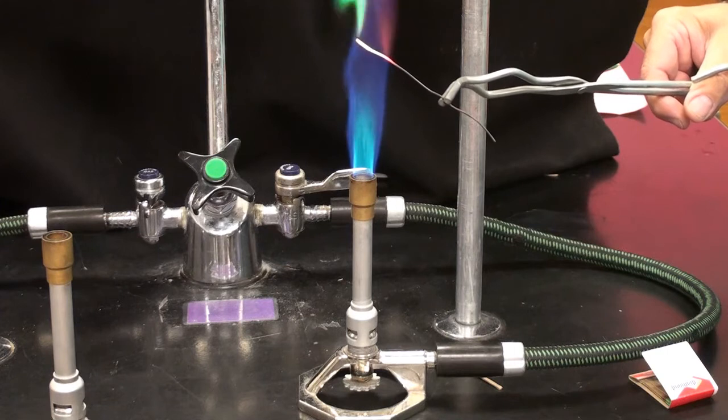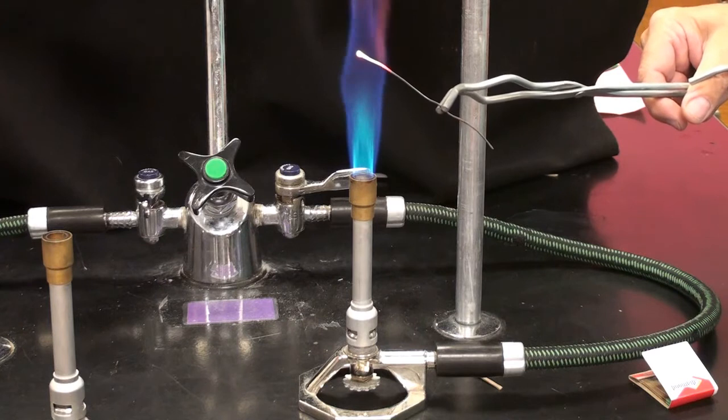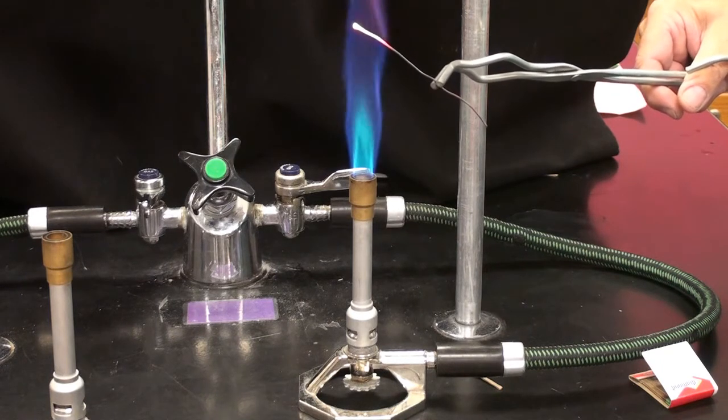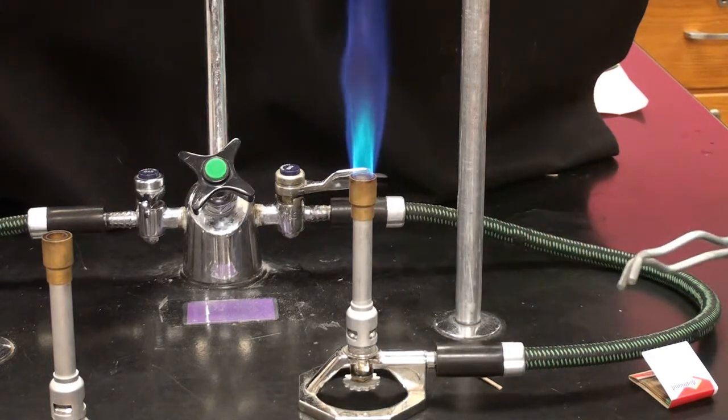By the way, I don't know if you can see, there's a little bit of a green flame there. That's an indication of copper ions. Okay, now I'm starting to get what looks like a round, little tiny raindrop of melted copper at the end. So I've hit the melting point over there. That's going to be really hot, so I'm just going to set it down over here on top of the wire screen.